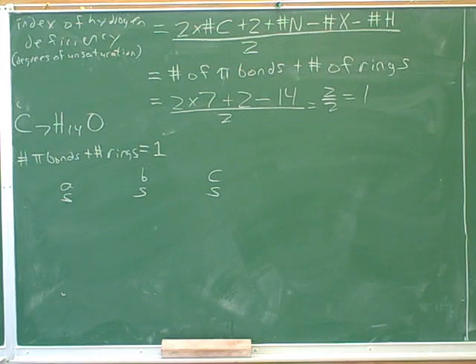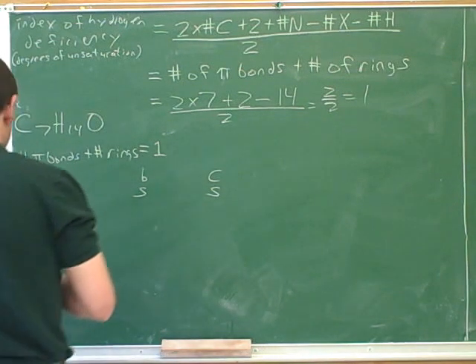Okay, well you might need to talk to your instructor about that if you can't read the graph. Although even then you can just estimate how far along it is. Less than a half. Yeah, that's right. And that's likely to be close to that. That seems like a very good approximation to me. So for group A, I would approximate it at 2.3, although maybe you were more right, 2.4, I don't know. It's actually hard for me to see those faint lines too. All right, so let's approximate group A at around 2.3.